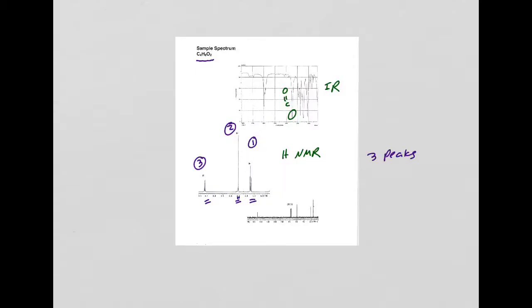The next thing to look at when you're looking at NMR is integration. So when we were doing the practice problem just now, okay, this was great. You figured out the chemical shift and we got a lot of information out of it based on the chemical shift. You were probably asking me, even though I can't hear you, hold on a second, what are these numbers? It says 3 hydrogen, 3 hydrogen, 2 hydrogen. What are these numbers? Well, I'm so glad you asked. Those numbers are the integration. By the way, you have this handout, so make sure you have it in front of you if you can't see my screen that well.